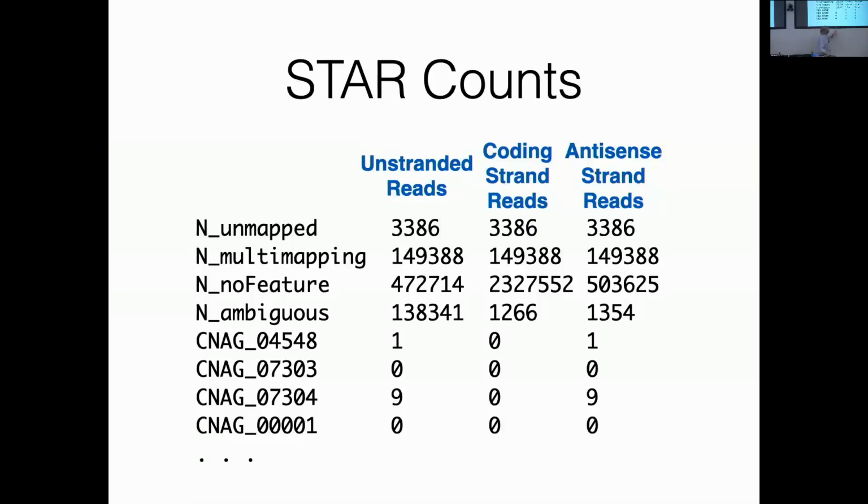These days, it's pretty uncommon to see unstranded data. It's not that it's never present, but the additional steps to making stranded data are pretty minimal. And so most library preps for making RNA-seq libraries generate stranded data.